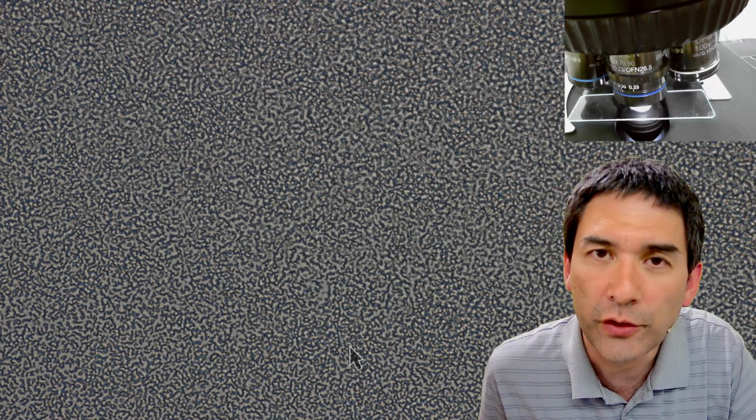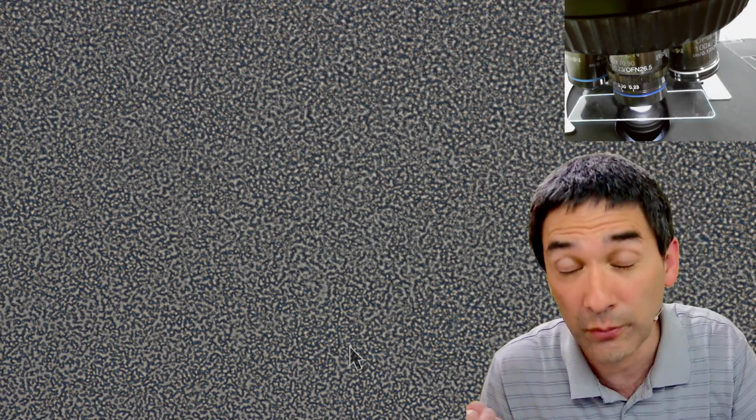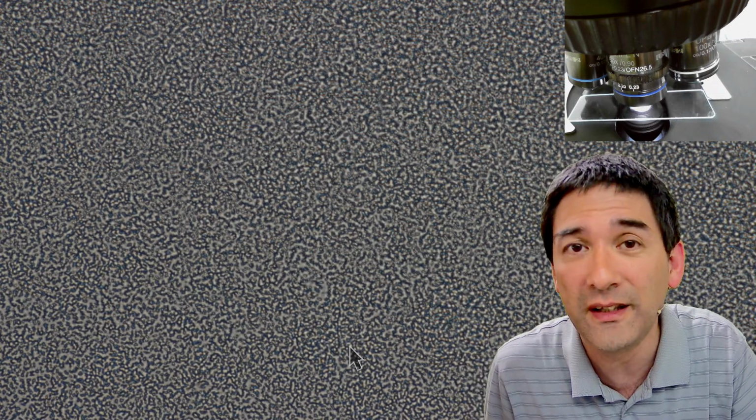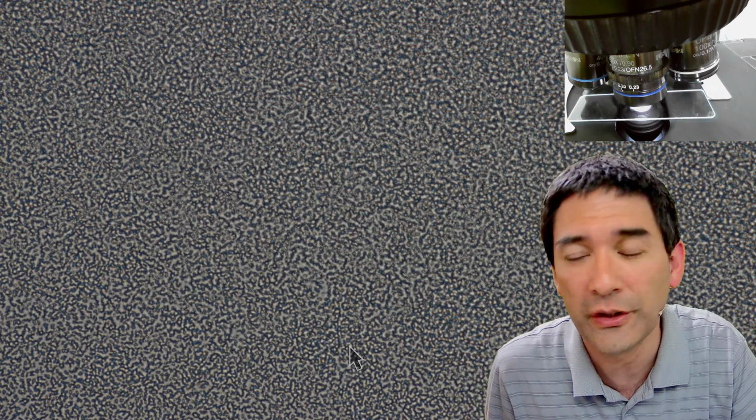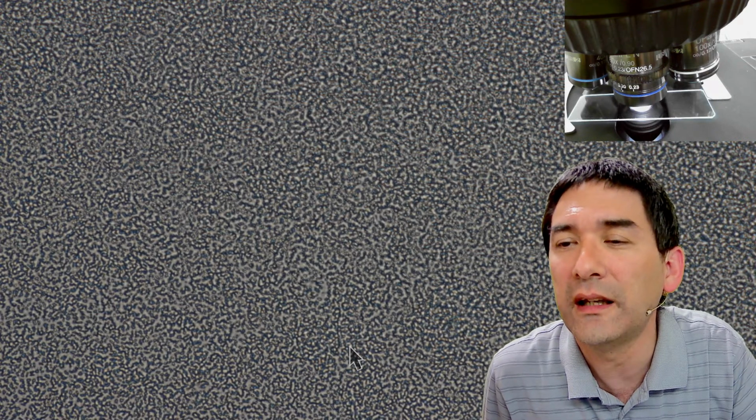That is why bacteria generally are difficult to observe. They're made mostly of water, of course. And if they're in water, then the difference in refractive index is too small, and then you're not able to see them properly. Okay. There are again a lot of greetings here.